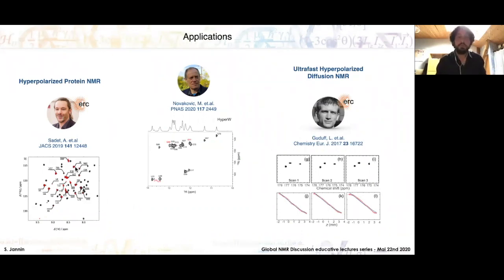So in this experiment, you have a protein waiting in the NMR tube, and you polarize water, and then you put water on your protein, and by exchange, you actually manage to polarize the protein itself, and then you can do either proton COSY or proton-nitrogen HSQC, etc. And this is something under investigation in Vienna, but also in the Weizmann with Lucio Frydman, who is also actively working on this topic. There's a very interesting recent paper on hyperpolarization of RNA, for example.